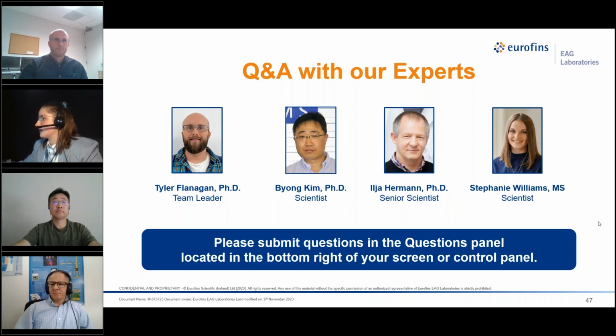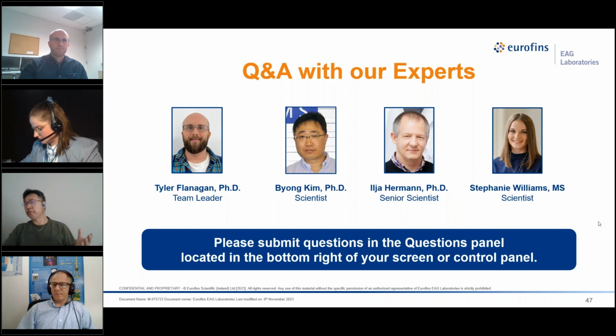Okay, and Byung, can you image crystal lattice planes with AFM? Well, let me give an example. We can image something called a moiré superlattice structure, such as in a sample like graphene monolayers deposited on boron nitride crystal planes. We can image this lattice structure down to a few nanometer periodicity.